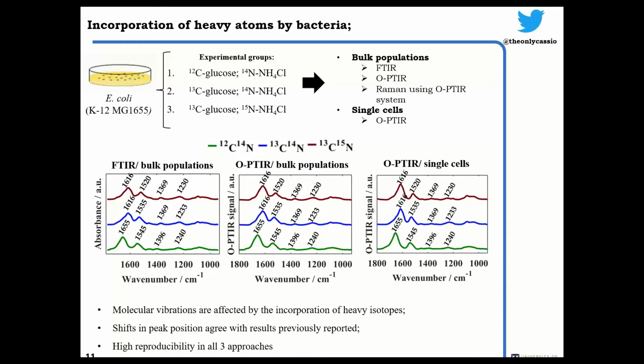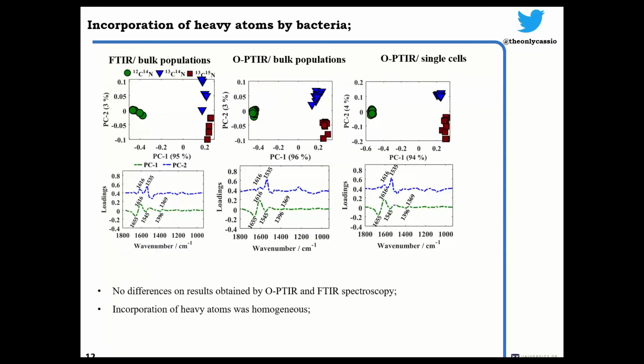There is high reproducibility in all three approaches. There are a lot of studies using FTIR spectroscopy to study bacterial samples. So first, we need to compare the OPTIR results, which is a new technology, with the standard technology, which is FTIR.